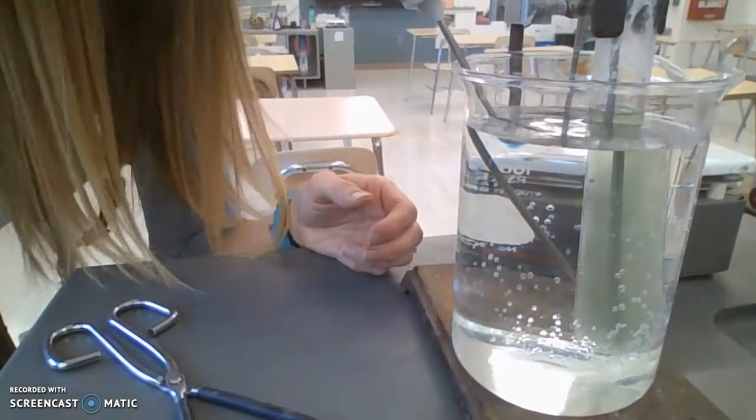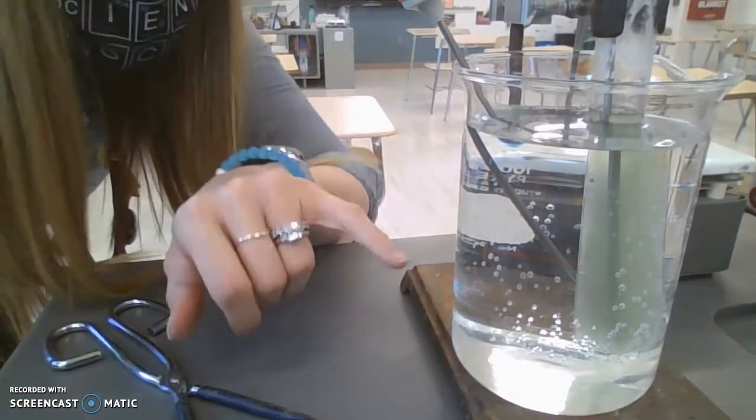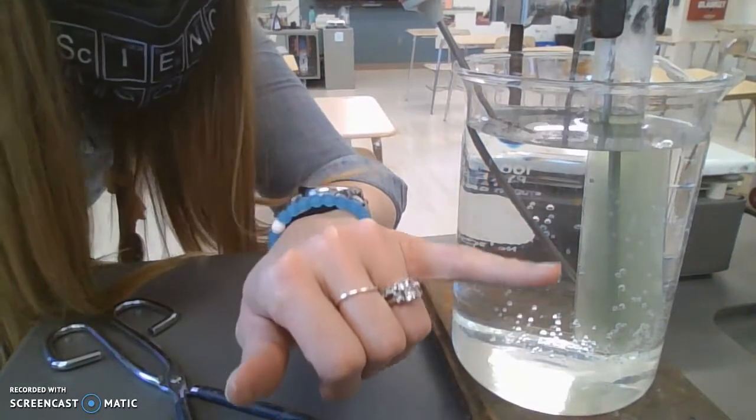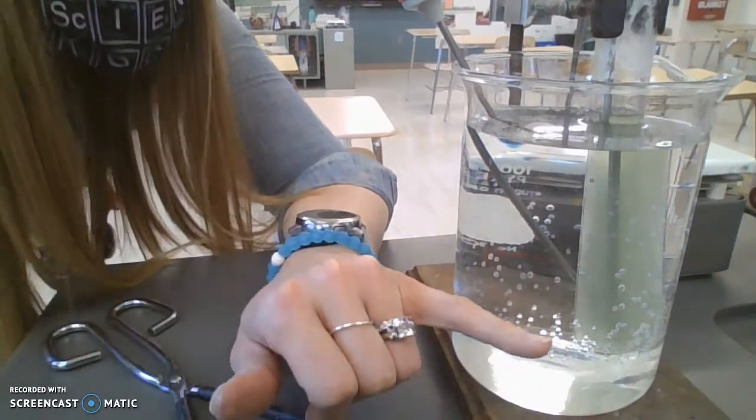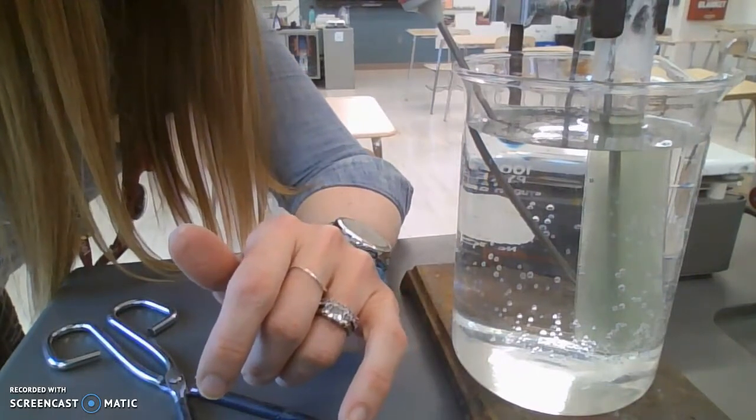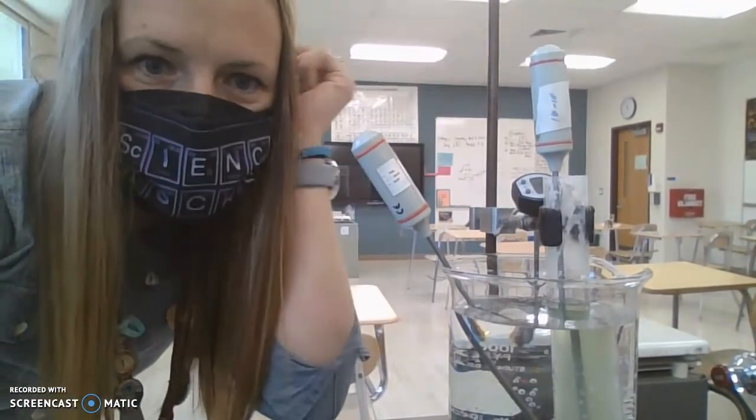And now it starts at 76 degrees, and you can see that it's starting to fog up in here, getting very crystallized on the outside. I will record temperature readings every 30 seconds until this thermometer is stuck in hard.